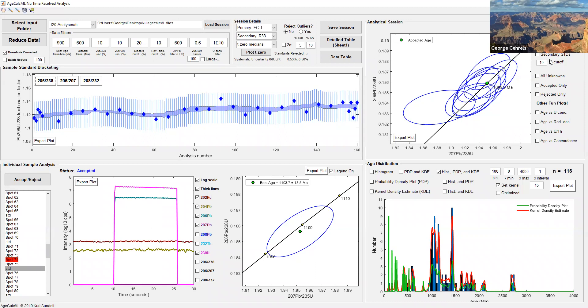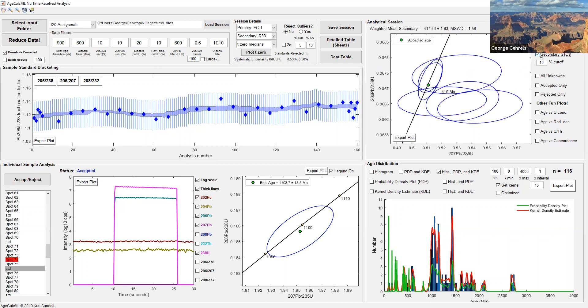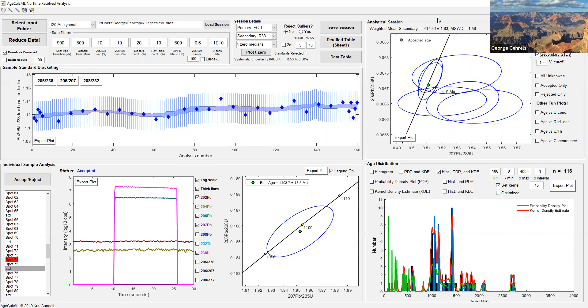Let's take a look at our secondary standards and see how we're doing. We know our secondary standard has a true age of 419 MA. Here are the measured secondary standards and their weighted mean age is 417.5. So that's about 0.3%, about a quarter of a percent too young. That's pretty good. If we're talking about reproducibility of 1%, here we are. Our secondary standard is a quarter of a percent. We would say that's a pretty good analysis.